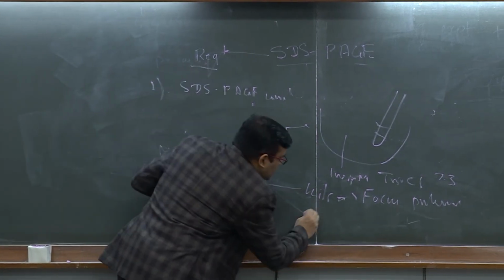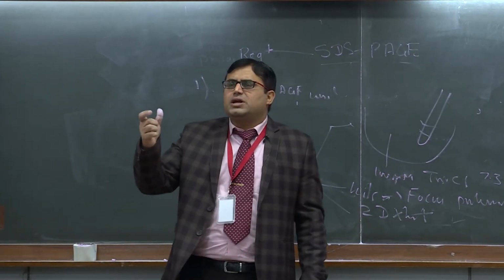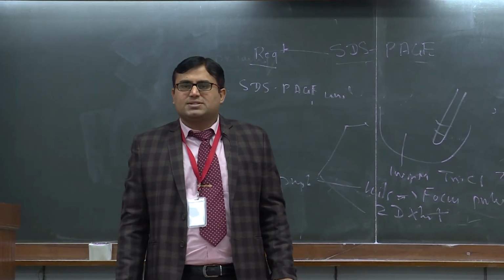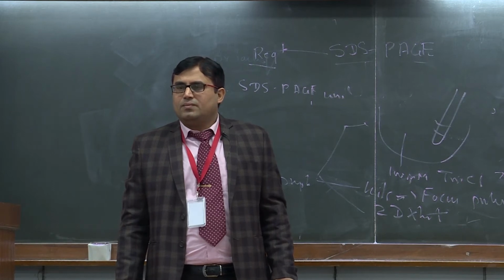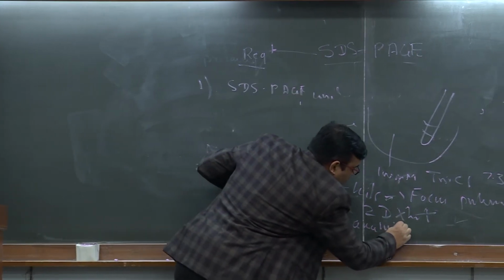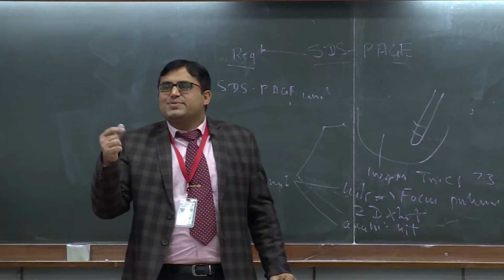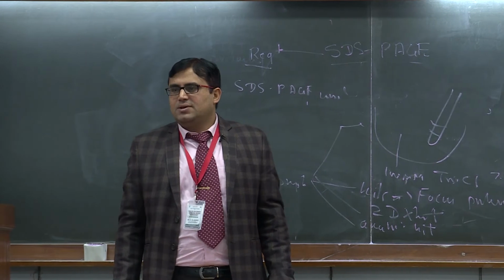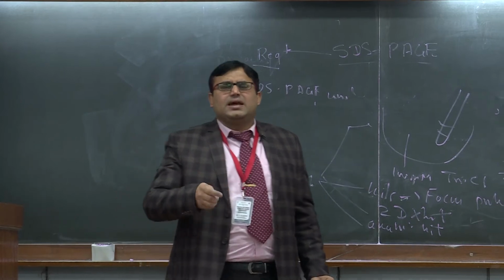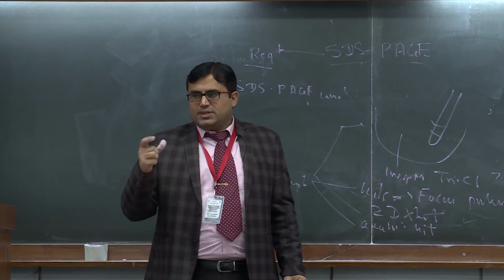We have a 2D extract kit. This is also a proprietary of G Bioscience. A very good kit, routinely you can use it for the extraction of your protein from plant tissue. Okay. We have a quantitation kit. This is proprietary of Amersham. So here you can extract as well as quantify the protein. And like this, n number of companies are there with their own products. You can use any of those kits to isolate the protein, right?